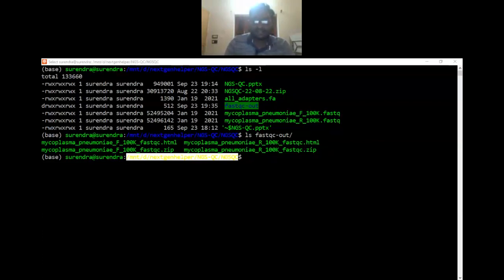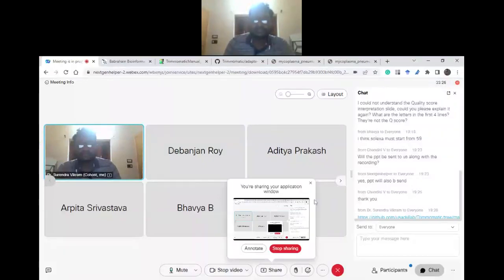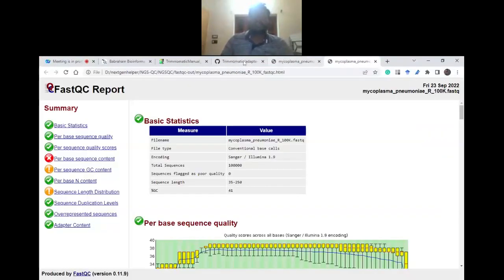I'll share the screen. Okay, so you can see here.